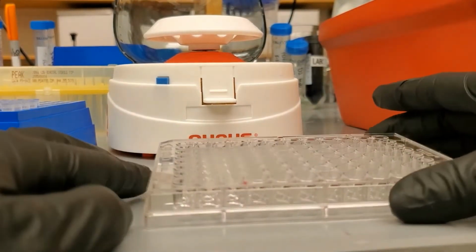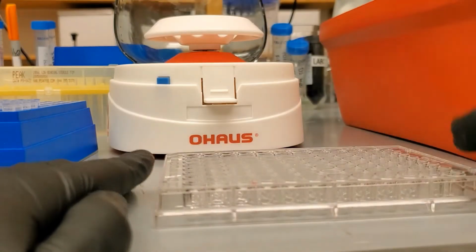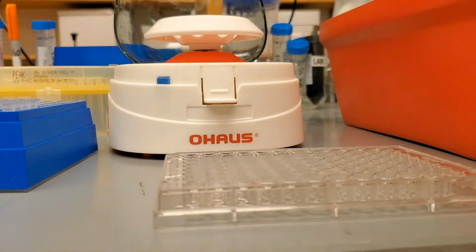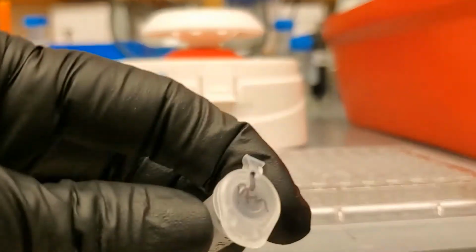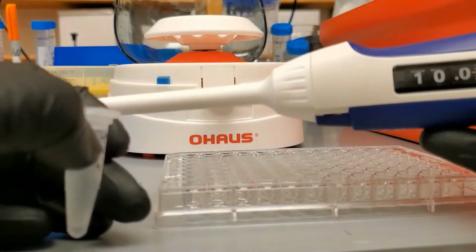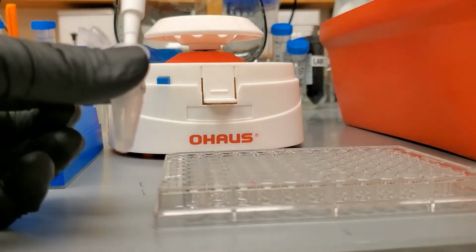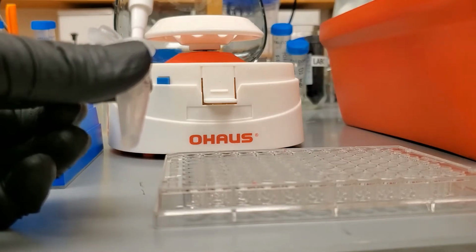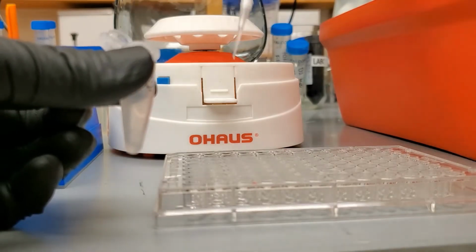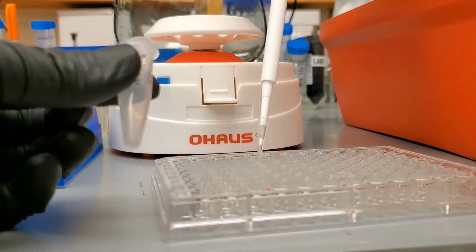After loading my protein ladder, I'm going to go ahead and start loading my actual diluted samples. So starting with my sample 1, and same, 10 microliters of each. So pipette up and down, and then add your 10 microliters to each well.